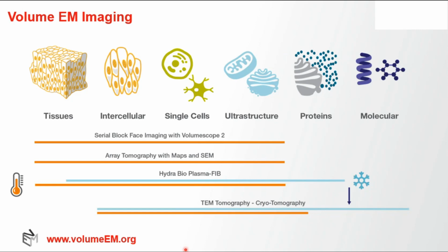But you can also do array tomography, as you've seen in previous talks. I'm sure you'll see more. But also cryo-tomography is at the other end, if you like, of the volume EM spectrum. So really we're covering everything now from molecular to tissues.